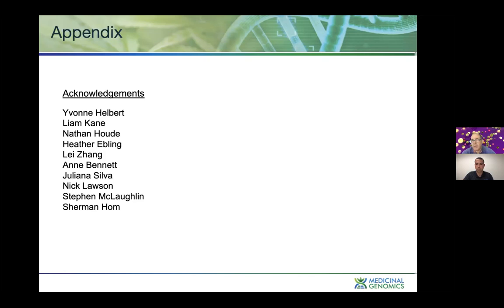I would hypothesize that it would, but I've got to think through how to set up an experiment that would sort that out. That might be a bit tricky without getting some microscopy involved. But we do know the molecular weight of the actual enzyme, so it doesn't need to be a very big hole for this thing to get in. So I would imagine it would chew it up if the membrane is ruptured, but we've not set up any experiments to directly address that question.